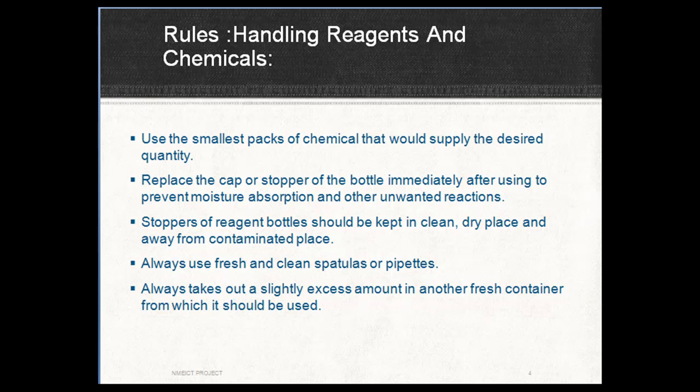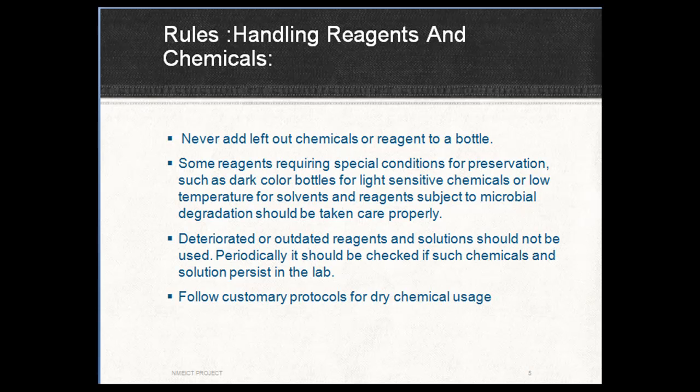Use small packs of chemicals that would supply the desired quality and quantity. Replace the cap or stopper of the bottle immediately after using, to prevent moisture absorption. Stoppers of the reagent bottle should be kept in a clean, dry place and away from contaminated places. Always use a fresh and clean spatula or pipettes. Always take out a slightly excess amount in another fresh container from which it should be used. Never add left out chemicals or reagents to a bottle.